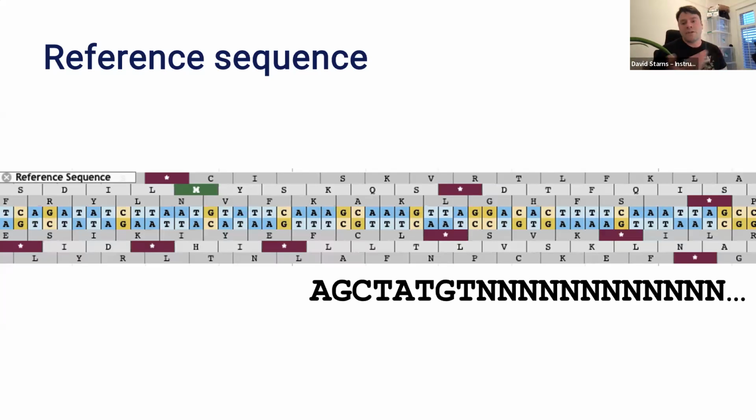Some of our genomes may be a little bit old, and the assembly methods might be a little bit ropey, so not complete. You might have gene models that just stop randomly, and that's not going to be very good in a multiple sequence alignment because I don't have any other sequence. You'll just see loads of Ns, and this might be important if you are looking at certain genes that have this.